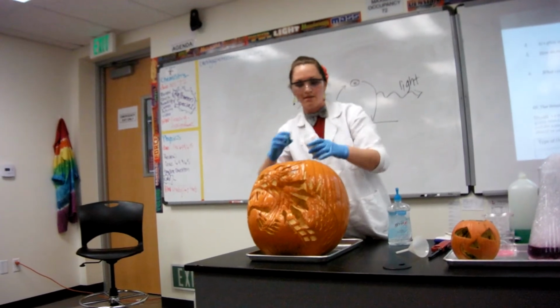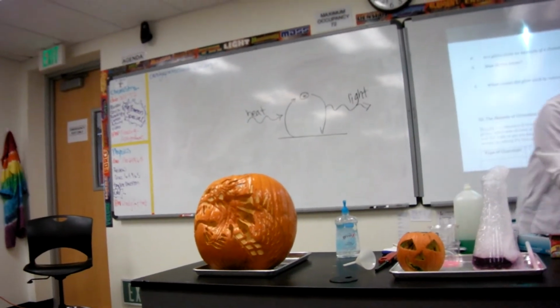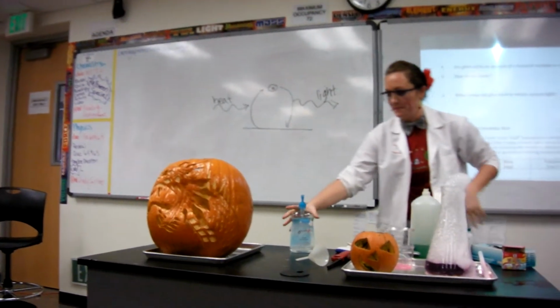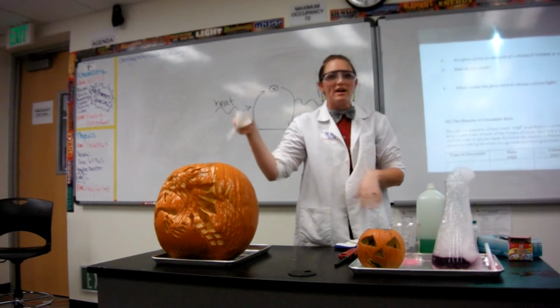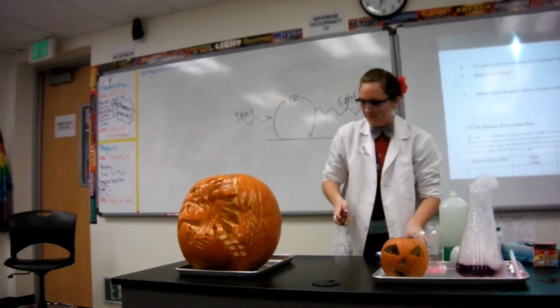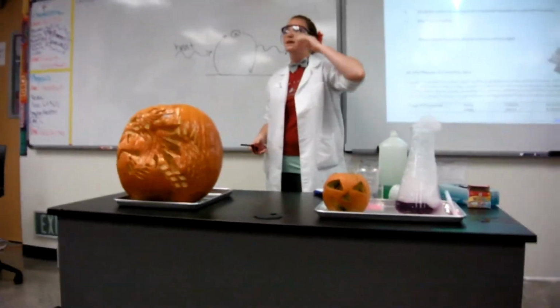And some lithium. Do you guys remember what lithium makes? Pink. Purple, pink. Like red, purple, pink? Yeah. Smells good. If it doesn't work, I'll light the little one because that one does work. And then I'll just put dry ice in this one if it doesn't work.